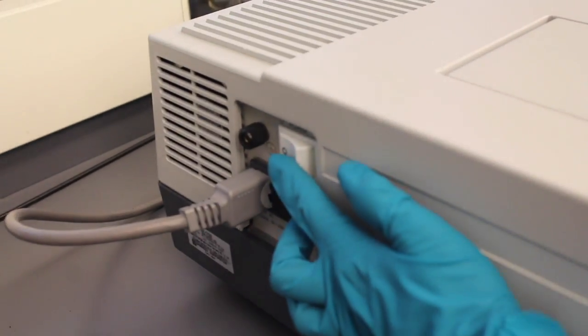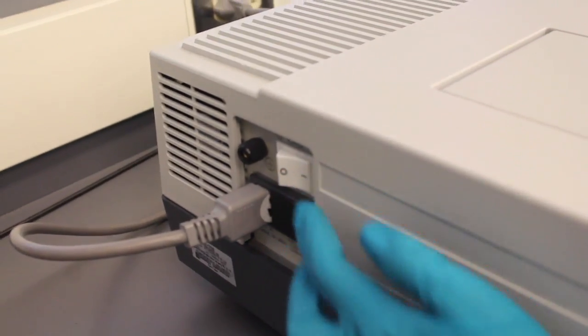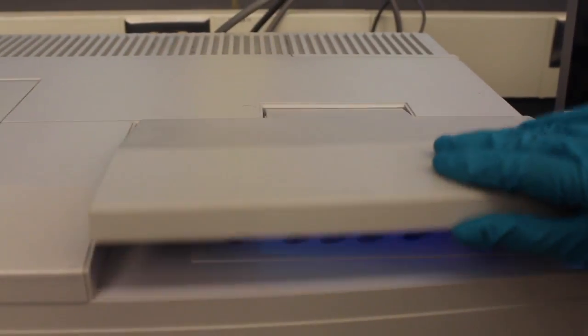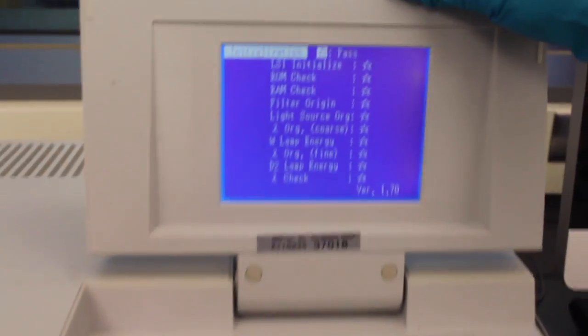The first step is to turn on the machine. Once it is on, the machine will start the initialization process.